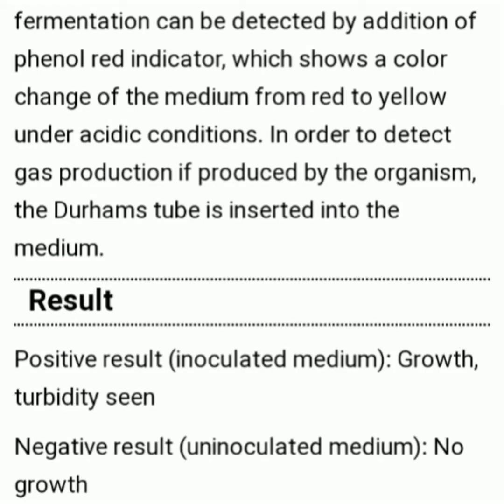So here we can see that for carbohydrate fermentation there are two indicators which we can use in this medium. The first one is carbohydrate fermentation. When any bacteria ferment the carbohydrate, we use an indicator, right? The other one is acidity.